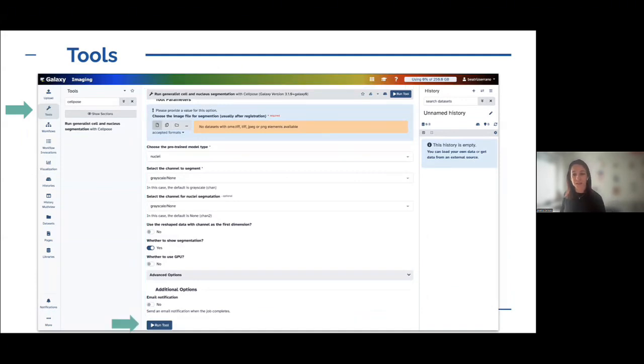And then on the right side in the history, there will be a new box that will appear saying, okay, there is a task here that is running. And this task will be yellow at the beginning while it's scheduled and can actually run or is running. And then when everything is good and it worked well, it becomes green. If something failed, it becomes red. And then you can go and check what was wrong and why it failed. So that's when you have a tool and you want to run it, that's very straightforward.